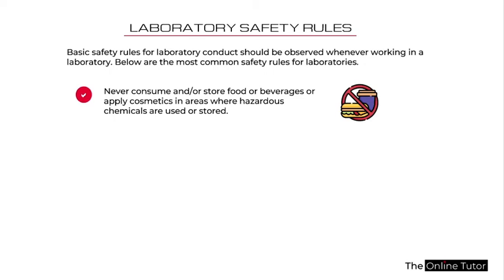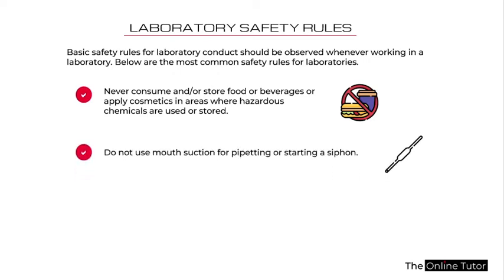And then you may accidentally be eating near where you are carrying out an experiment, and there may be a spillage, and your bread or whatever you are eating may soak up some of the acid or some of the substance that spilled, imbibition. So you need to avoid those so that you do not consume any chemical by accident. So don't consume or drink anything whilst you are in the laboratory.